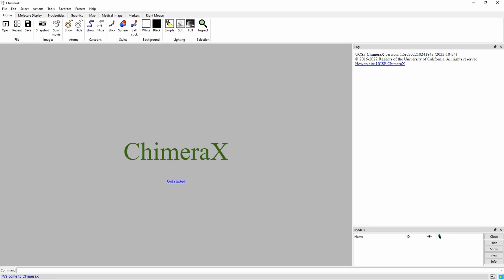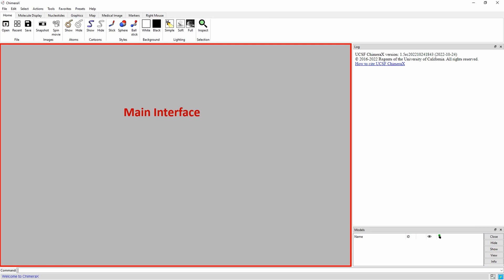Let's start by familiarizing ourself with the user interface. The main interface, highlighted in red, shows the model of the protein or DNA. Here, the model can be moved around using the mouse. The view it shows is what the image will look like if a snapshot were taken at that moment.